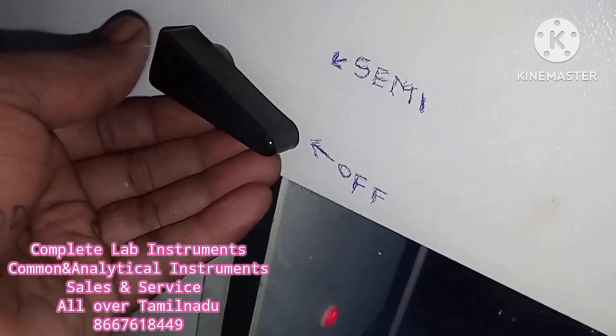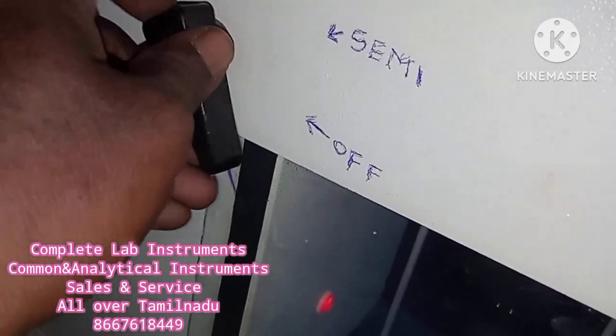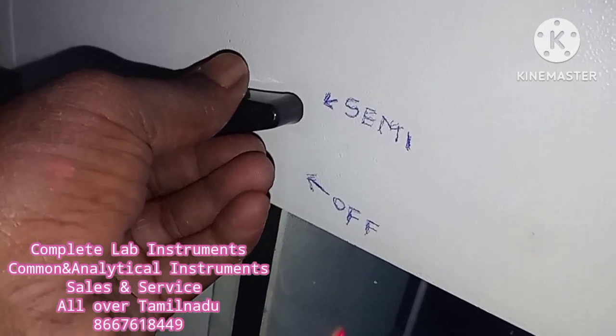This is half position, this is on position. This is the approximate position.